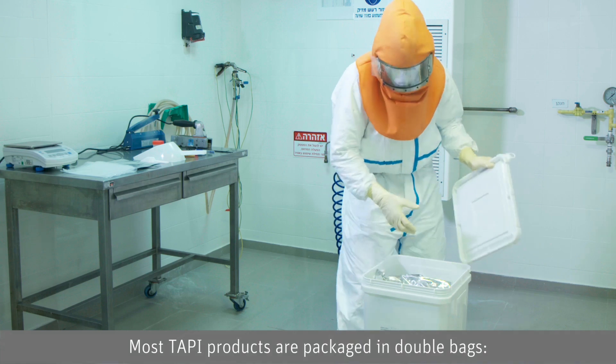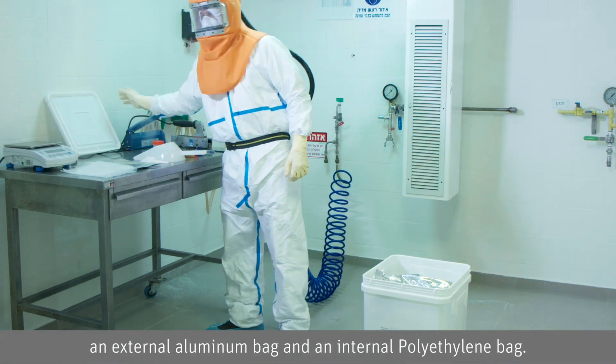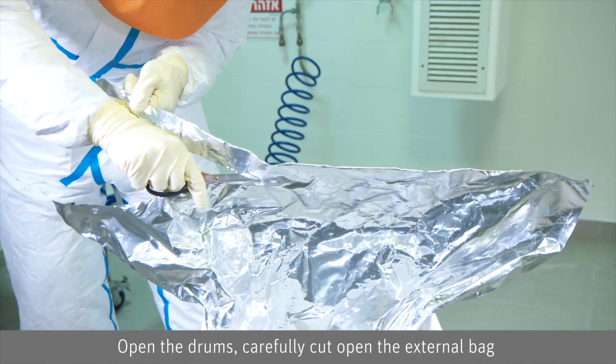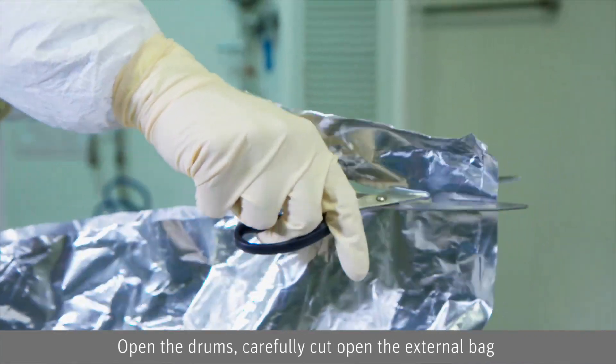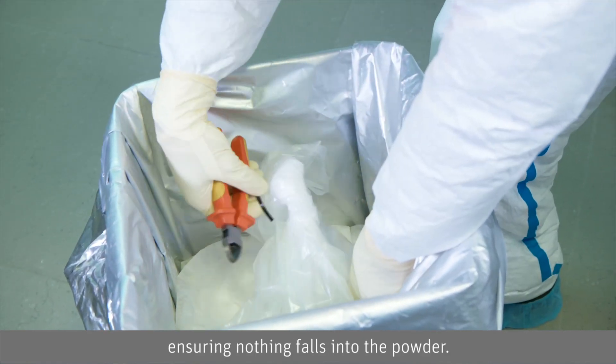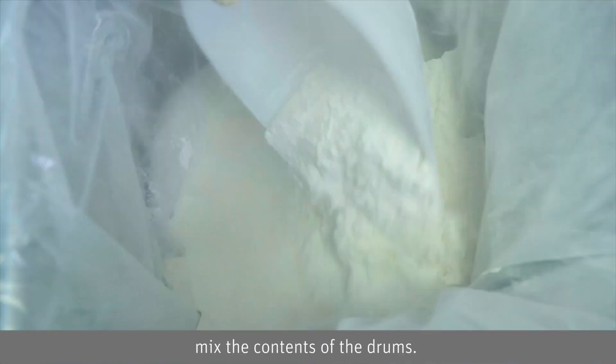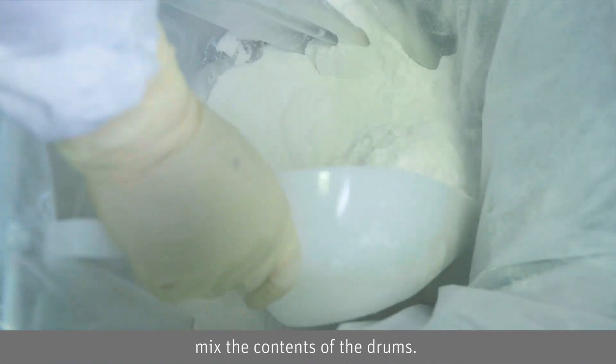Most TAPI products are packaged in double bags: an external aluminum bag and an internal polyethylene bag. Open the drums, carefully cut open the external bag, then cut the zip tie on the internal bag, ensuring nothing falls into the powder. Using a large spoon or bulk sampler, carefully and thoroughly mix the contents of the drums.